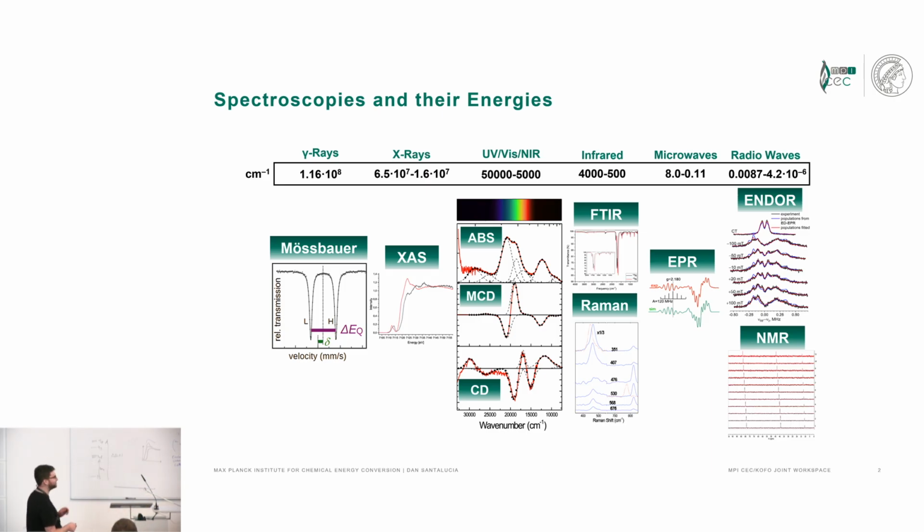The hard and fast rule of what distinguishes a gamma ray from an X-ray is that an X-ray originates from an electronic transition, and a gamma ray originates from a nuclear transition. Okay? So we're going to talk today about nuclear transitions, but we're going to use them to probe electronic structure information, because that's what we're interested in as chemists.